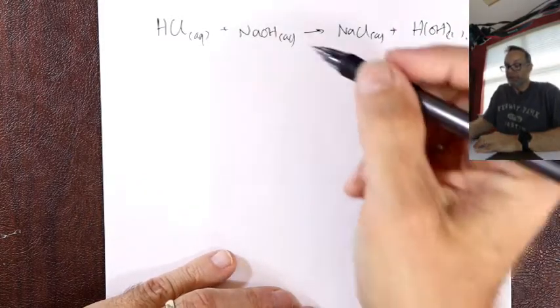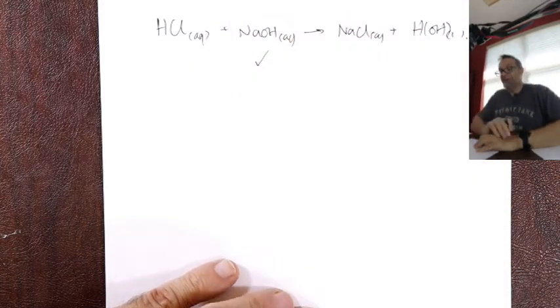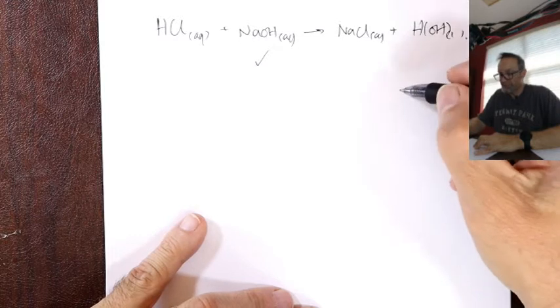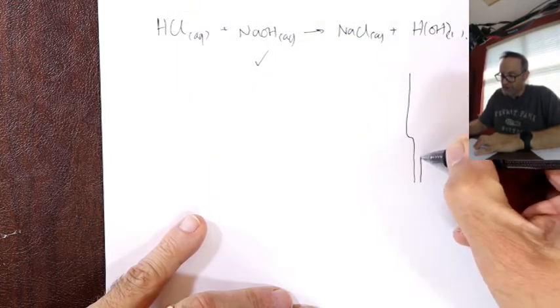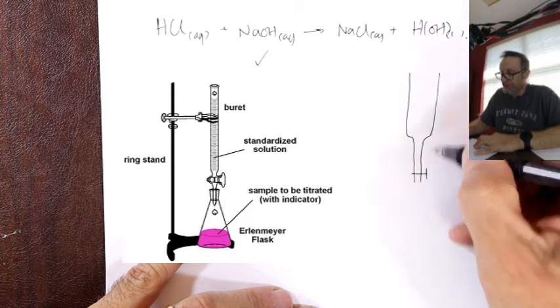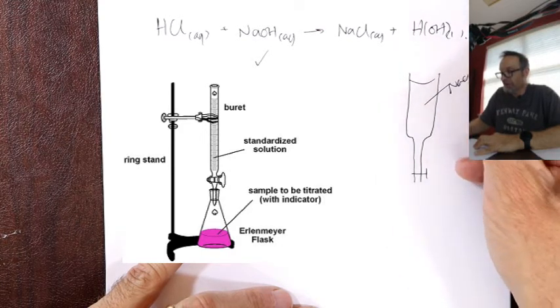Okay, so we know the concentration of this guy, right? We're going to set it up again. So I'll do another bad drawing. Should you do this in lab, just keep that same NaOH in the burette.